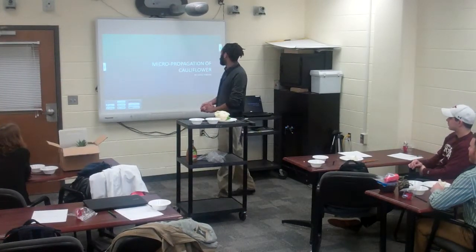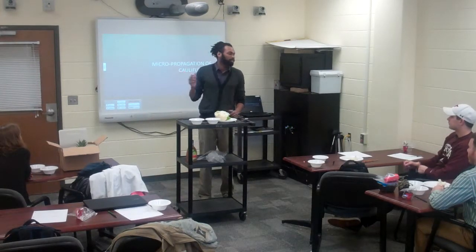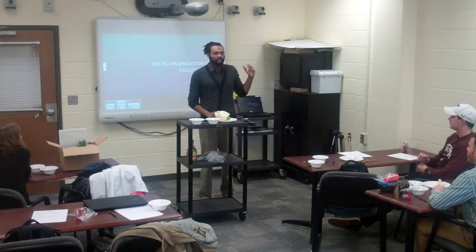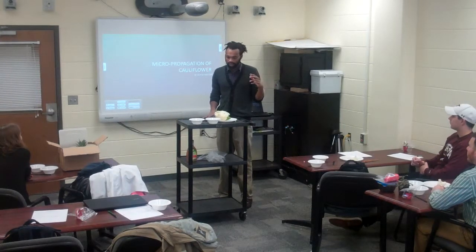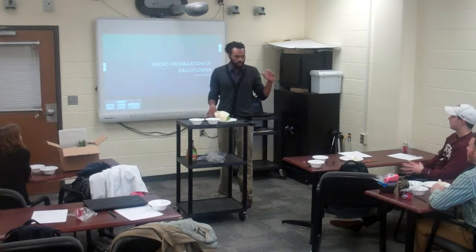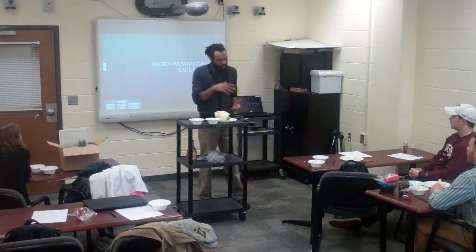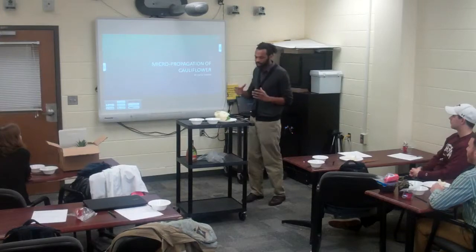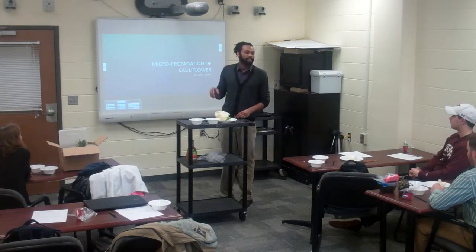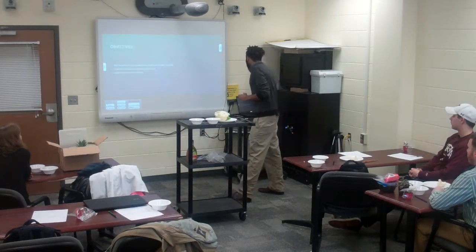Today we're going to be learning a little something about micropropagation of cauliflower. Now, micropropagation is a form of asexual reproduction, but it's more sciencey. It's a way to produce plants that aren't as ready to just reproduce on their own. You put them in a petri dish and give them some nourishment so they can survive until they can root, and then you can transfer that into something else. So that's what we're doing today.